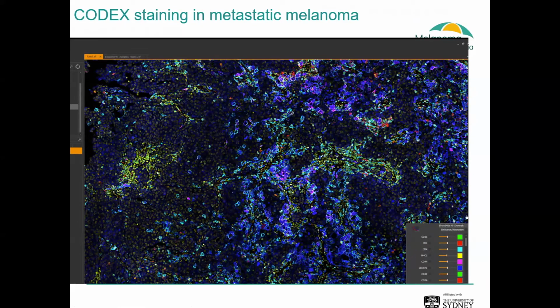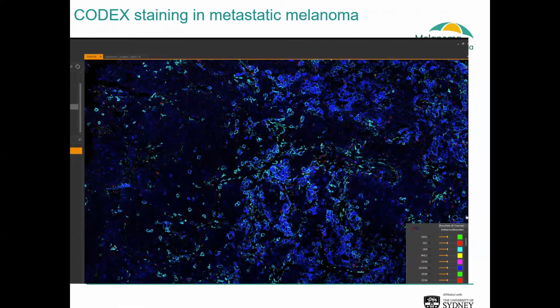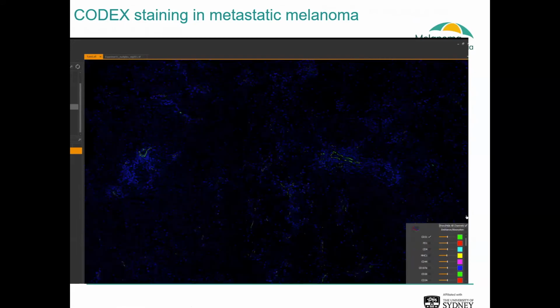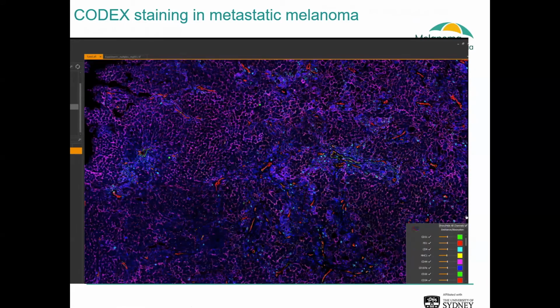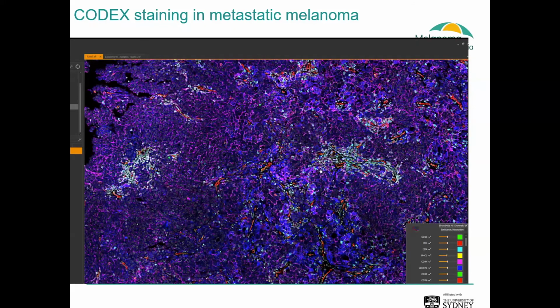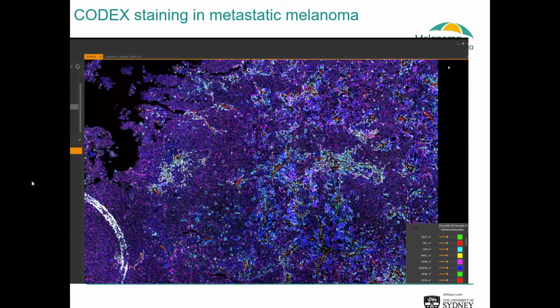accurate single cell phenotyping. And with this system, this is one of our melanoma sections stained with the panel. We can see the resolution is excellent, and we can see compared to some of our other singleplex or up to 6-plex staining runs, we can see every immune cell or tumor cell or vasculature within the tumor microenvironment. So really powerful technology that we're able to profile and characterize all of the cells in the tumor microenvironment. So it gave us confidence that we'd be able to take these images and create useful data from them.